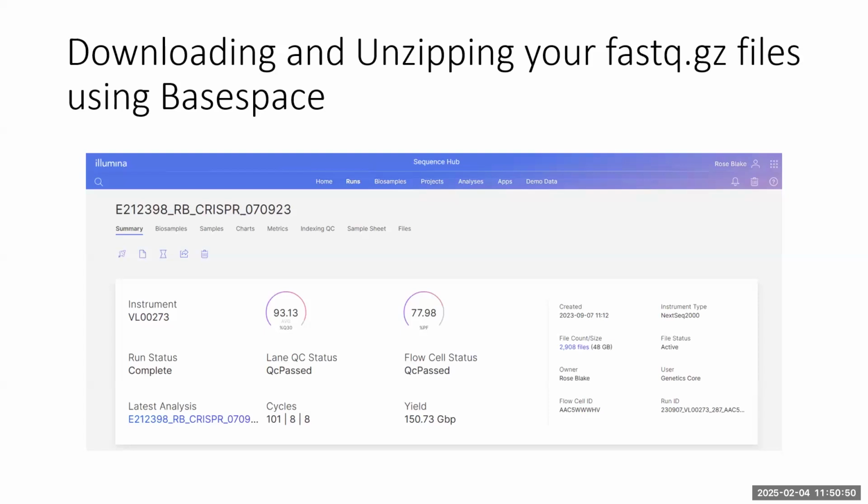So we've switched now to Twist. I think they're a bit more expensive, but so far the libraries we've been getting are of a higher quality. Honestly, the highest quality might be worth it, because you can buy the oligo pools quite cheaply, compared to if you actually pay for the whole library, where they tack on quite a big charge for the cloning. And if you do it yourself and you do it well, the libraries that have been made at Roslin have been higher quality than anything we've got from commercial ones.